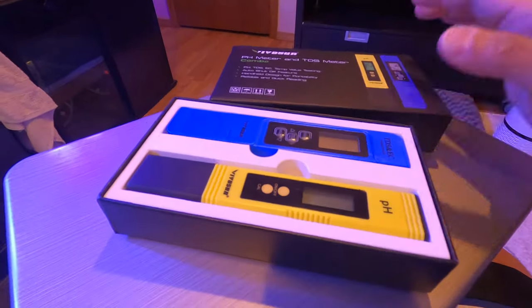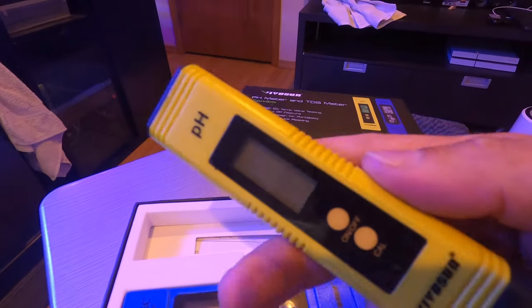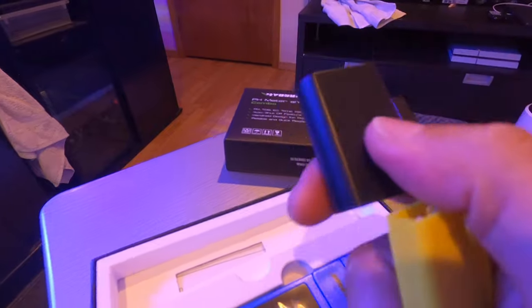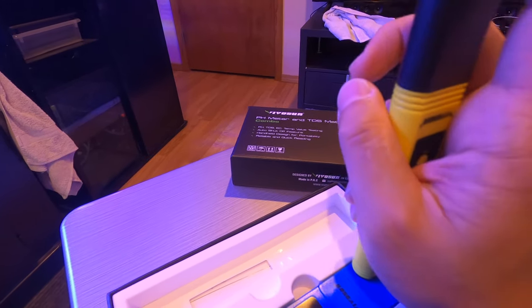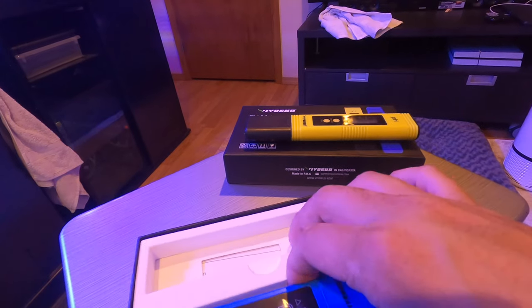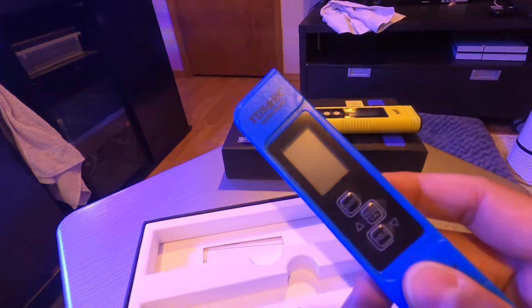I'm going to open it up and show you what it all includes. The yellow one is the pH monitor. This end is what you dip in the water. You always want to rinse it with clean fresh water, otherwise salt buildup will form and you'll have to calibrate it a lot more.